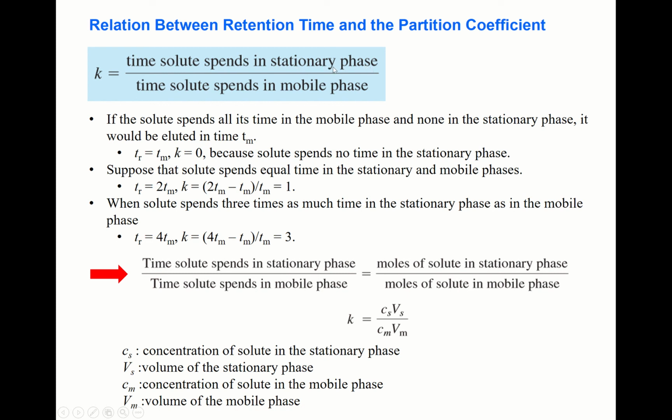So that means what? The solute now interacts with the stationary phase, so that makes the time bigger than the time the solute spends in the mobile phase. Okay, here is an example.